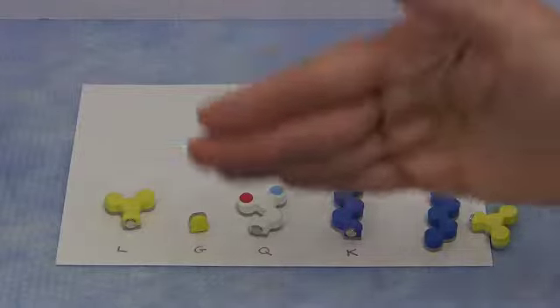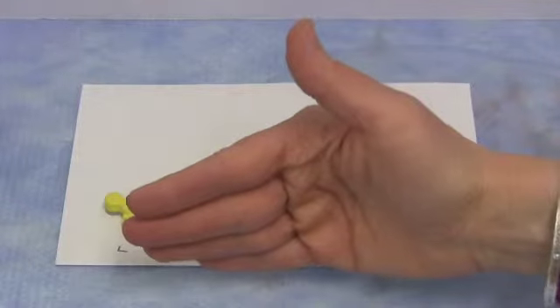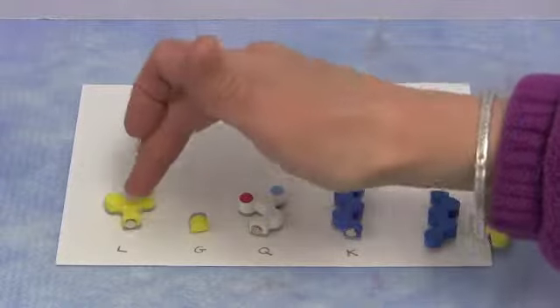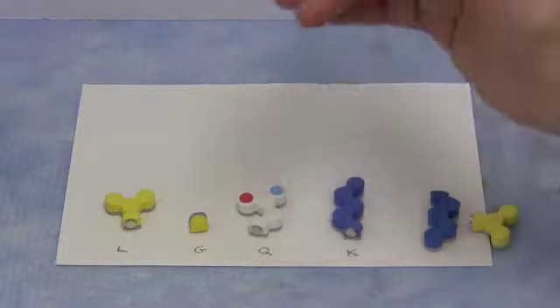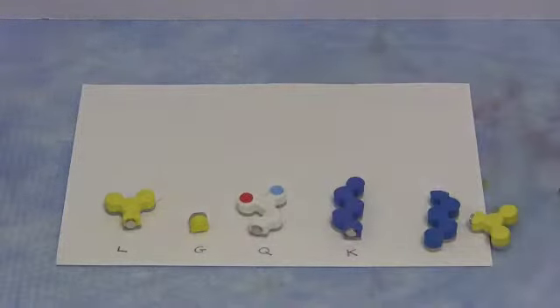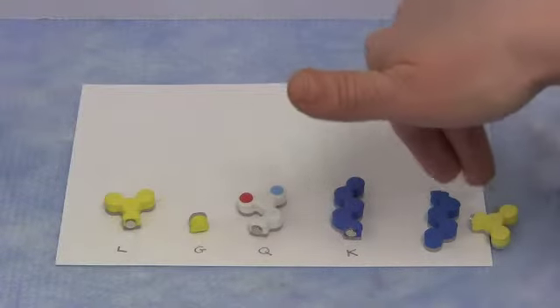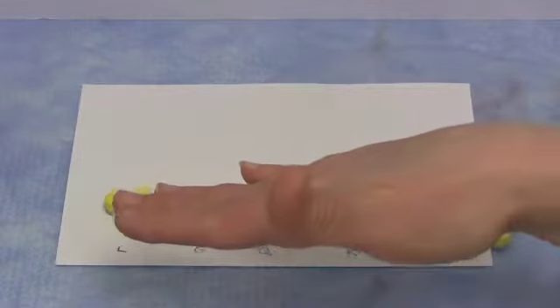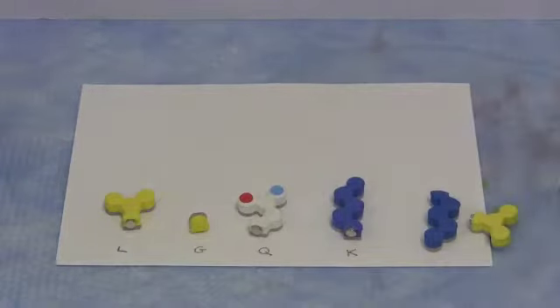Now, as we put the paper in the tank, the mobile phase will start moving up the paper, and very soon it'll hit these spots of sample. The molecules in the sample will then partition between staying bound to the stationary phase, to the water, or going into the mobile phase and moving a little way up the paper. And the chemical nature of these side chains will determine the relative affinities of these molecules for the stationary phase or for the mobile phase. So let's have a look at them.